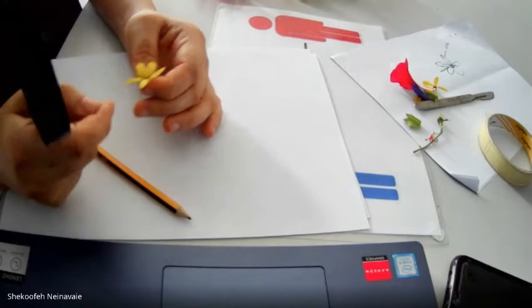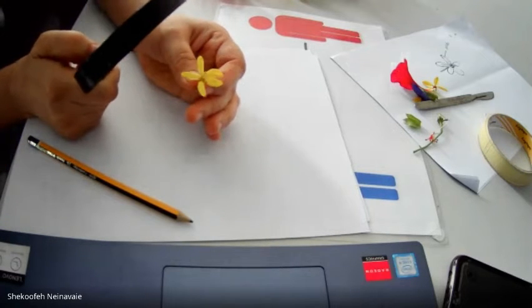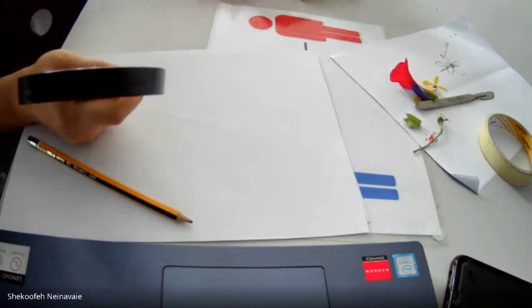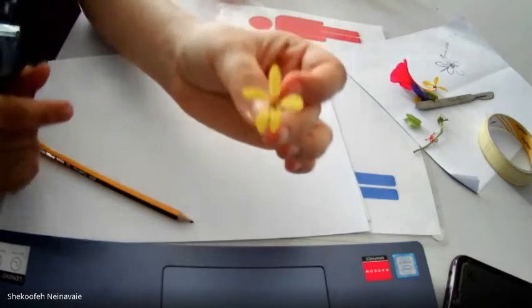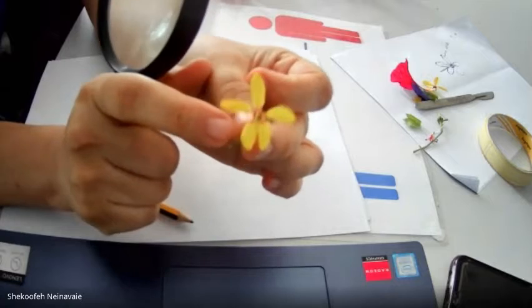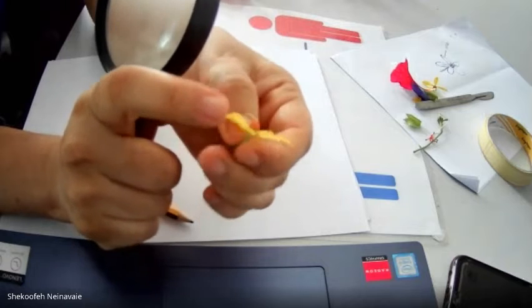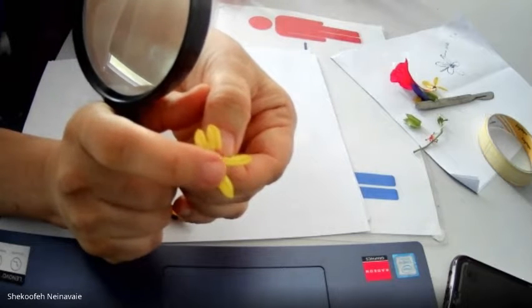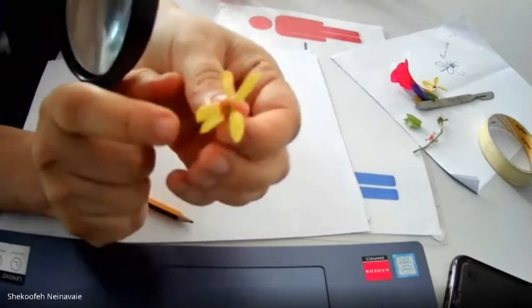The female part of this, usually the males are more numerous than the female parts. We have these yellow parts. The male parts, for example, I take one where fertilization has already happened, you see that the male has turned brown or red. That means it has already been fertilized, so there is no pollen grain remaining on the male. These red parts are the anthers, which carry pollen grains, and the males are usually more than the female. There is only one female, as you can see.